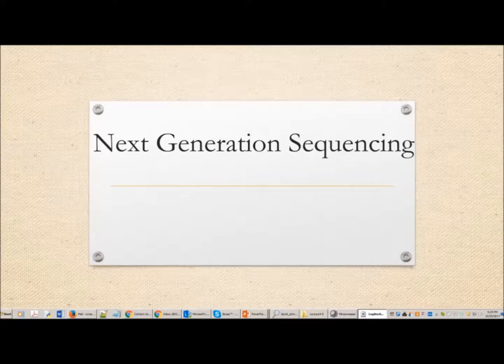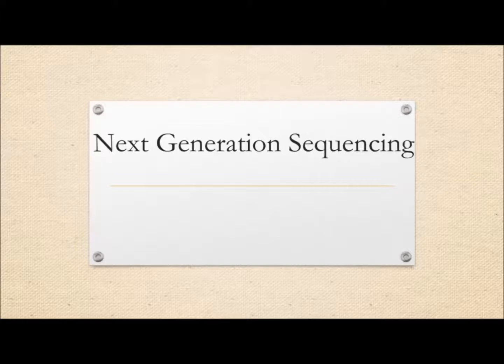So we come to what is the final topic, perhaps the most important in this discussion on sequencing at a genomic level. And this module has to do with an introduction to next generation sequencing. Next generation sequencing is literally the state of the art today. The genome of an entire species can be determined.